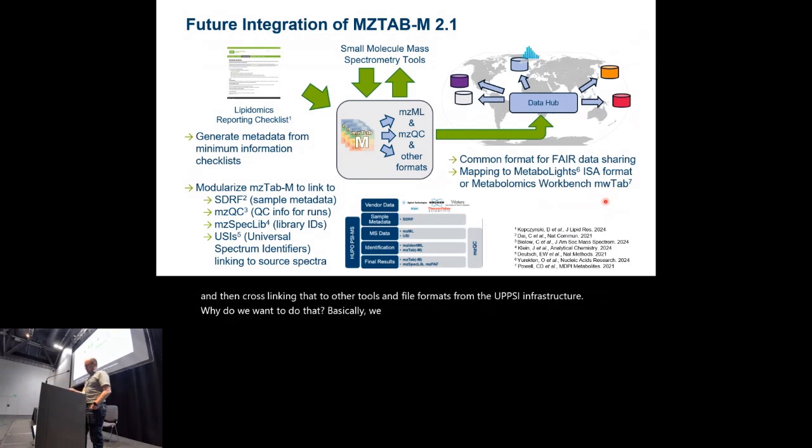Basically, we can then use mzTab-M as a central integration file format between all of these different spheres and different tools and resources, and can also use it, for example, to gather all of this information together in one point at one location, and then use this information to create submission formats or submissions directly to the large data repositories like MetaboLights or Metabolomics Workbench. We're actually currently already developing a prototype of mzTab-M to MTBLS mapping, so being able to directly create a MetaboLights submission from our mzTab-M file, together with mzML, of course, and other files if necessary.